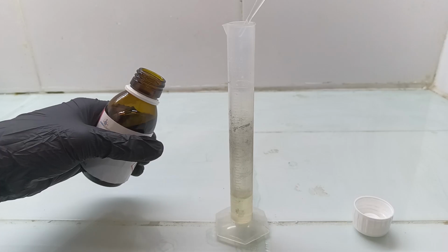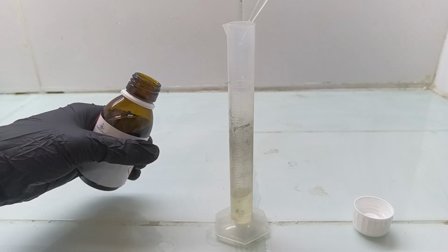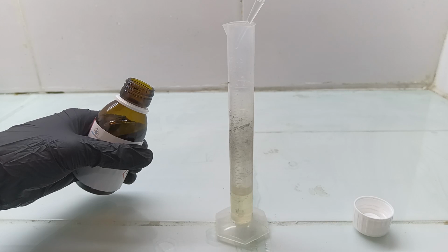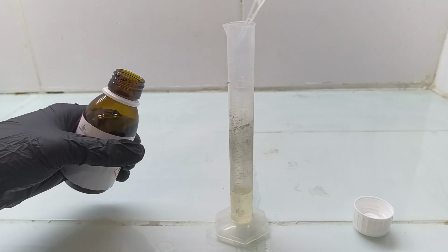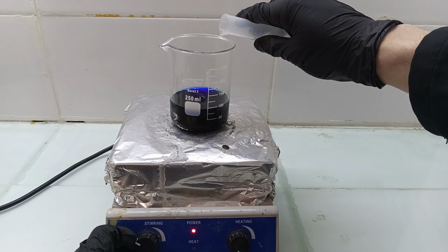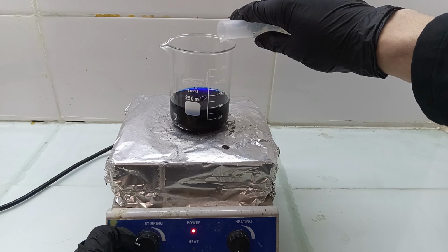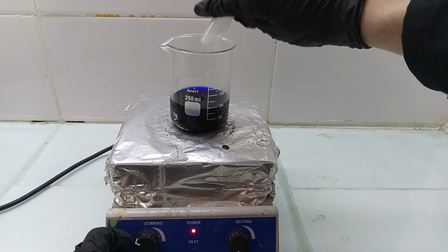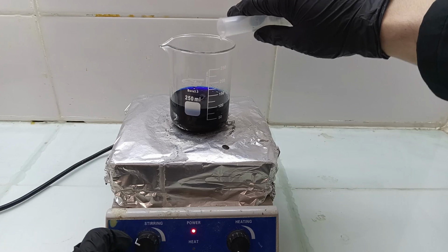If you are planning to do this synthesis, proper ventilation is absolutely necessary, since pyridine has a very strong and irritating smell. I added the pyridine to the solution, but not much happens at first since it takes a bit of time for the complex to form, so I left it to stand and stir for a few hours.